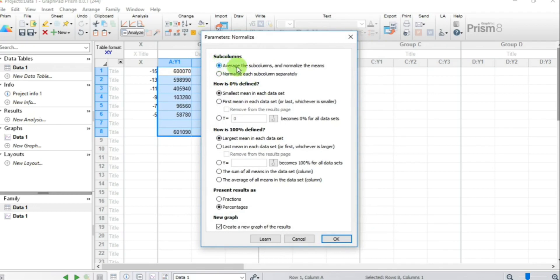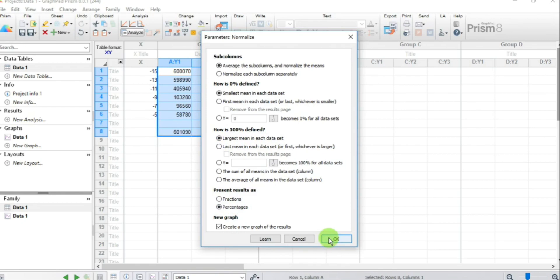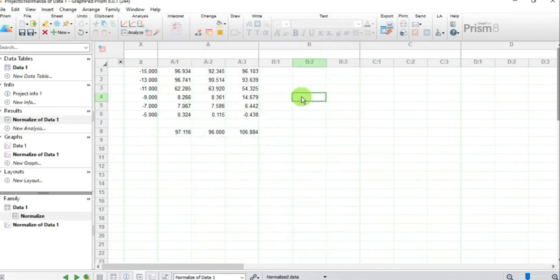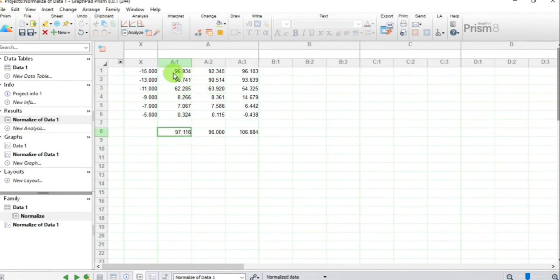In the dialog it says: average the sub-columns. Zero percent is defined as the smallest mean in each data set, and 100 percent is defined as the largest mean in each data set. Express results as percentages. Press OK. Our response values for both the agonist and stimulant are now converted into percentage responses.